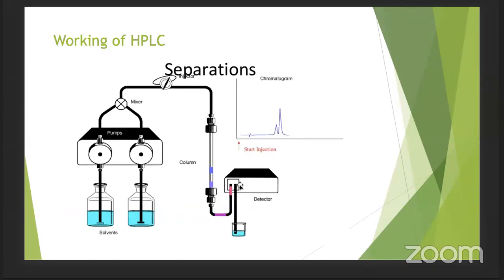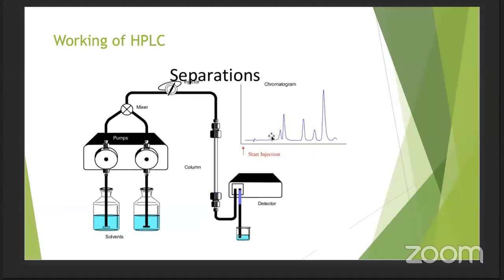Now, the second component is in the detector and you see a second peak. Further, this is the last component and your chromatogram is almost complete. So here on this axis, you have the retention time. Now, what is the retention time? Retention time is the time that a particular component was retained in the column, or the time that the component that you want to separate or isolate stayed in the column. That is the retention time.